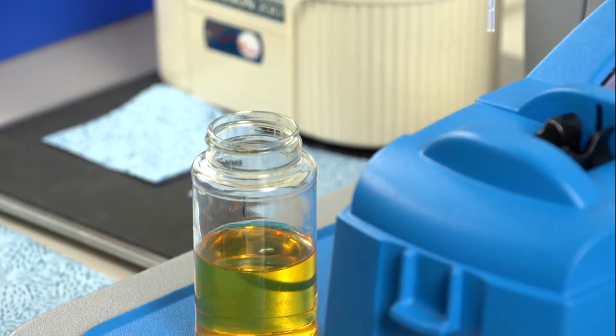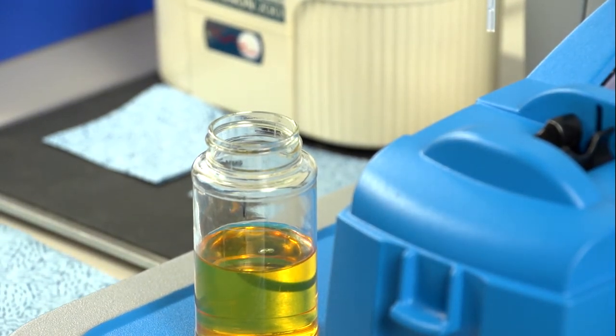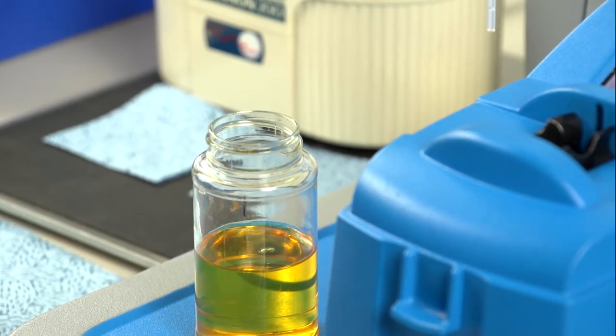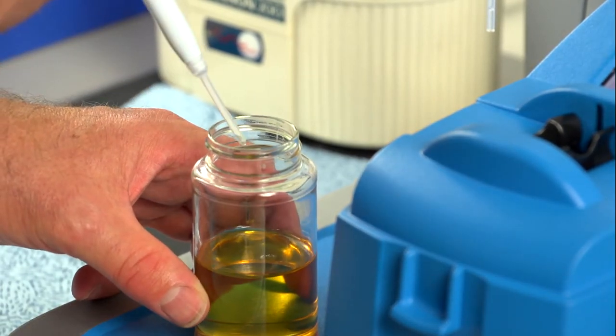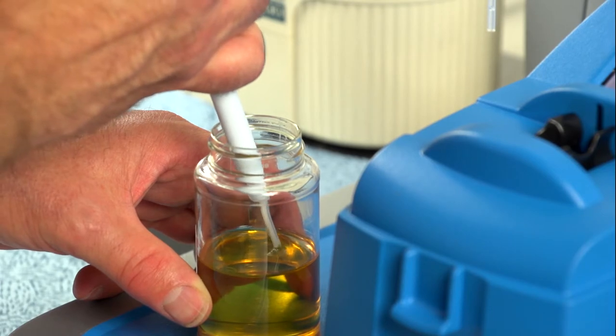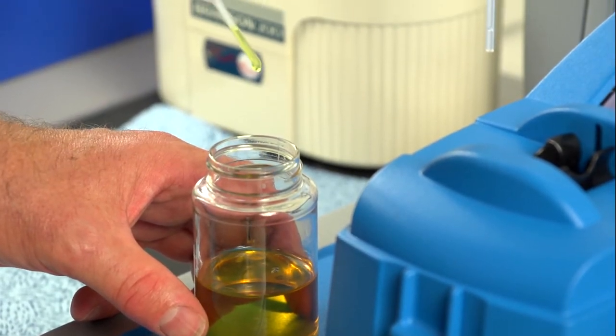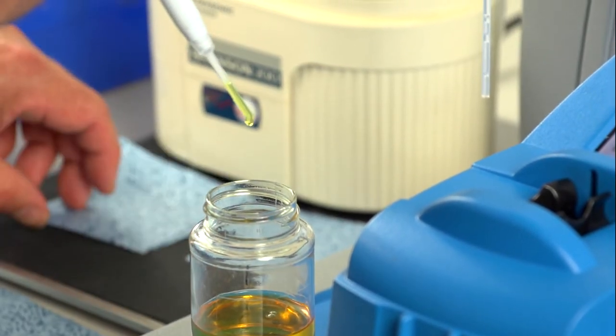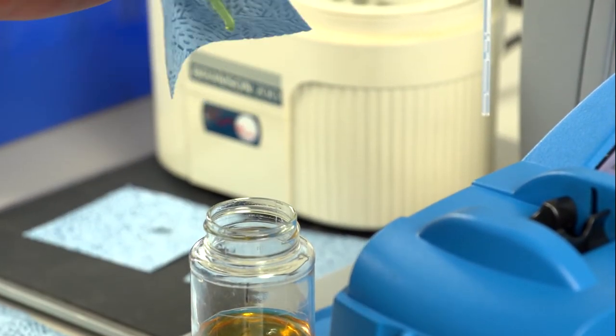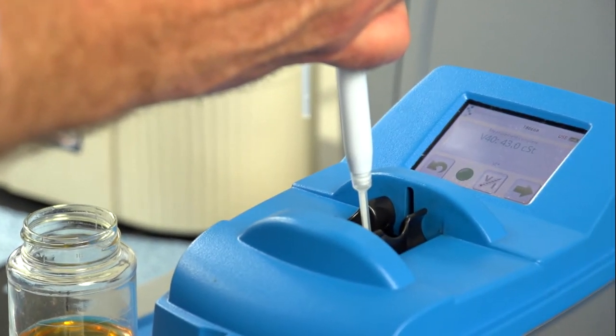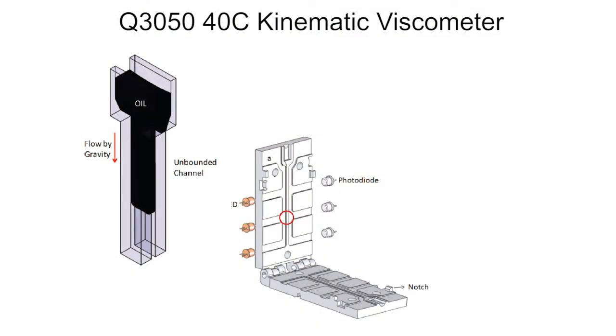The MiniLab 53 uses a spectrovisc viscometer, which measures 40 degrees C kinematic viscosity. Simply take a single drop of oil, drop it into the viscometer. Parallel plates heated to 40°C give you a direct measurement of kinematic viscosity.